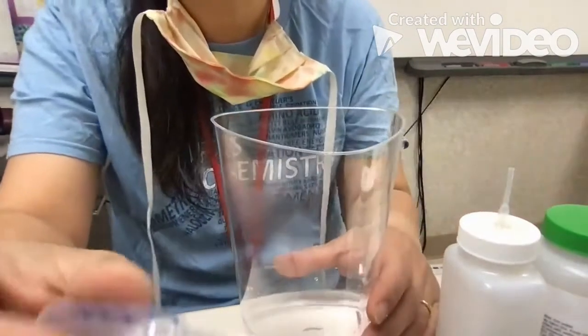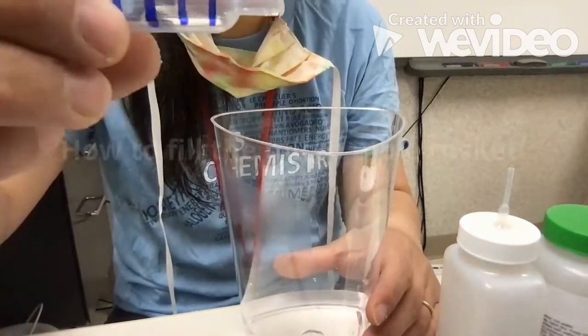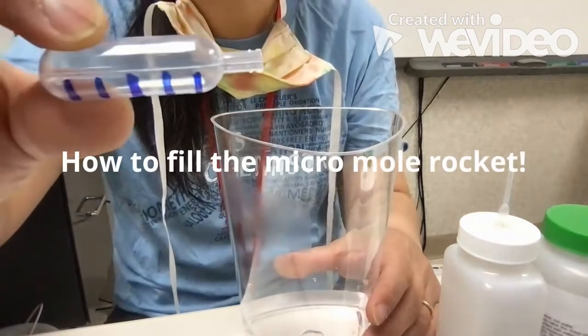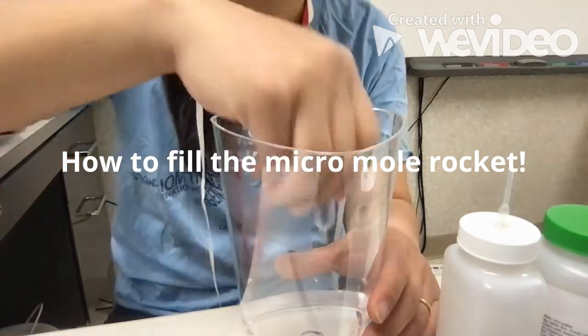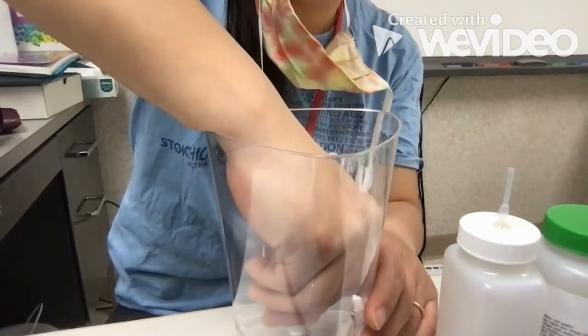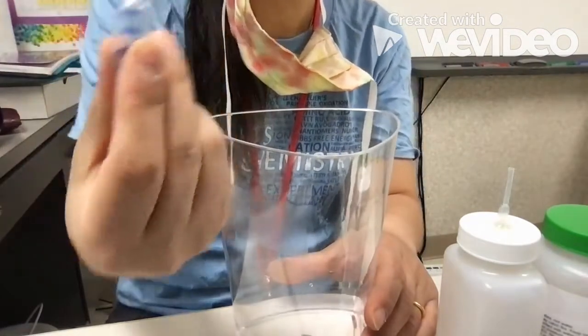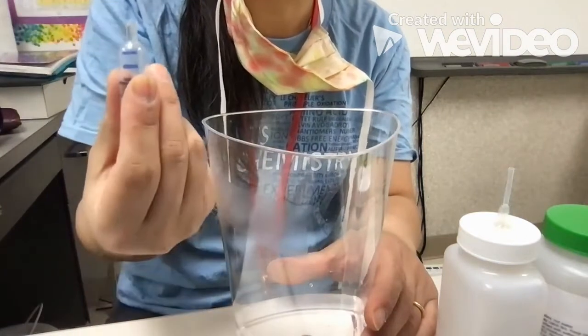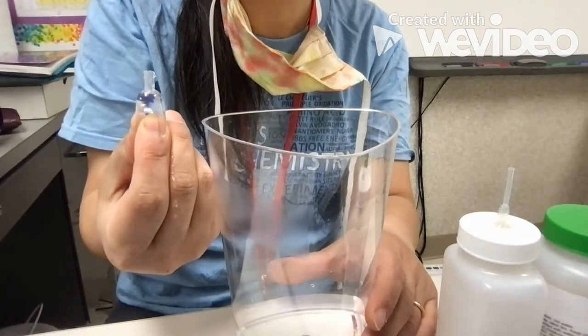So you can see that they have 5 lines, dividing this into 6 parts. To fill this up, you want to fill it up completely with water. To do that, you want to squeeze first, then draw up the liquid. Okay, now it's half filled. Turn it over, then squeeze it again. Some water might spill out a little bit, all the way.